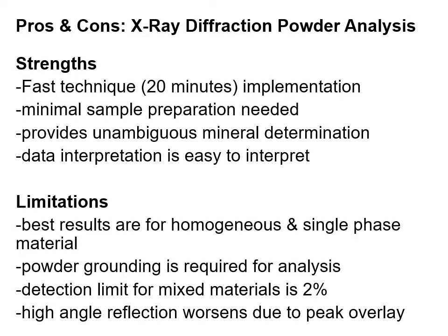So the limitation is you need to grind that powder so it fits that holder. Detection limit for mixed materials is about 2%. It only works, or the best results are for homogeneous and single phase material. And you do get a high angle reflection issue when it comes to peak overlap. At high angles, that's when you get two peaks over two peaks, where it can be problematic to determine which plane is that.